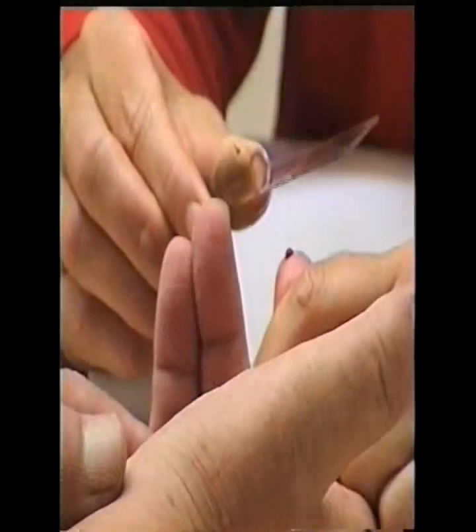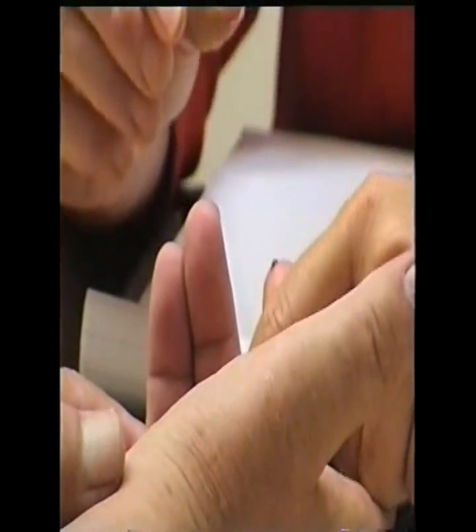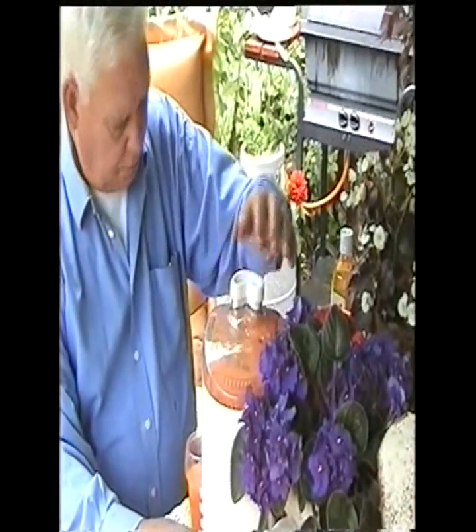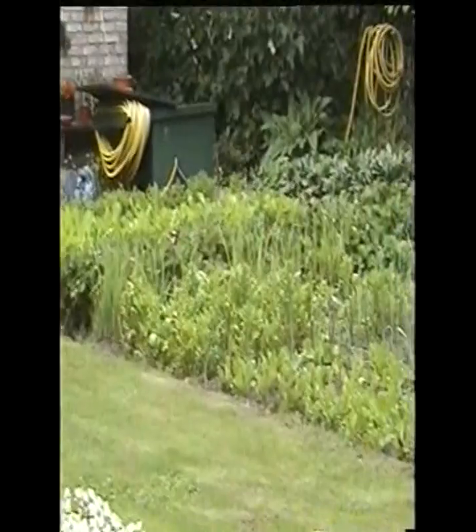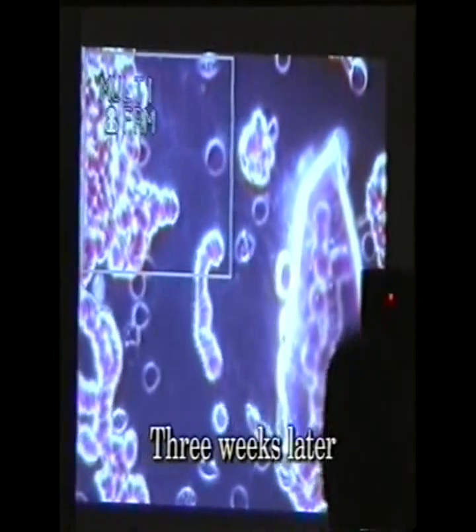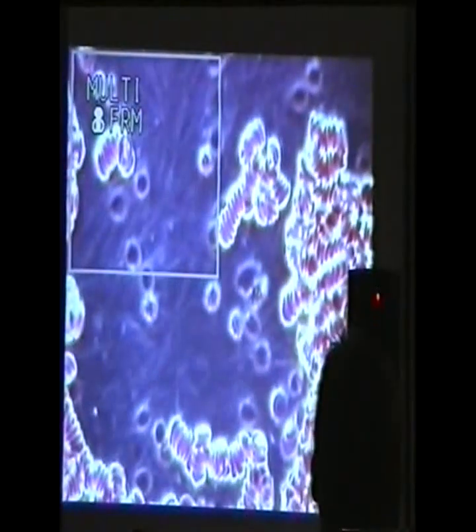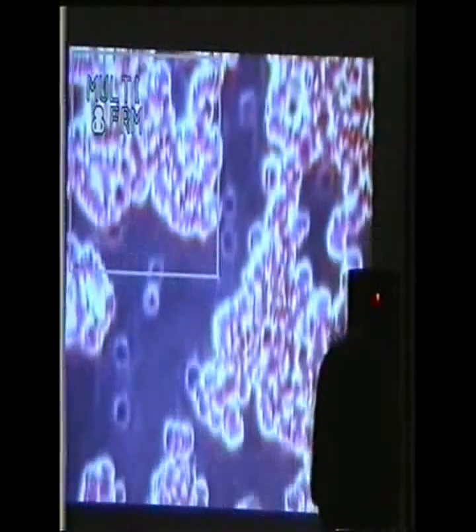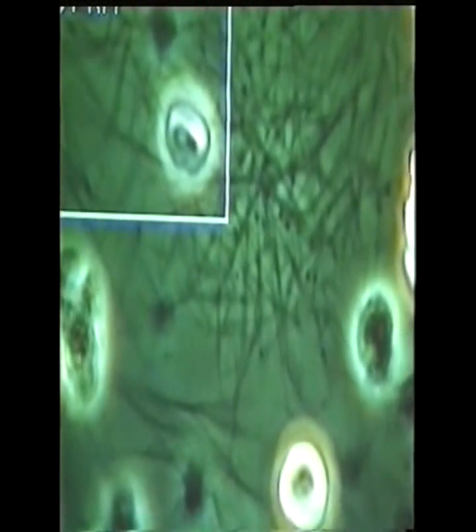After three weeks, we test the blood again. Meanwhile, the patient, who was free of complaints, has radically changed his dietary pattern, uses no alcohol, no refined sugar, but is still a smoker. Each EM produced vegetables and uses 20 ml EMX twice a day. In the first instance, there appears to be more activity in the erythrocytes, but in other areas, the blood seems to have deteriorated. Depoisoning from the organ cells to the blood and lymph system has probably started. Not until the body is completely free of toxic material will the blood improve as well.